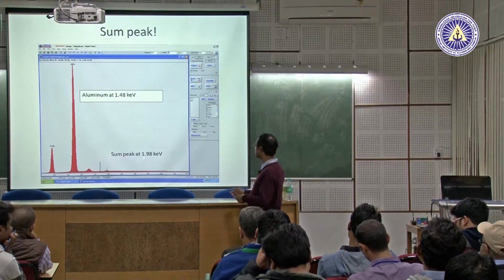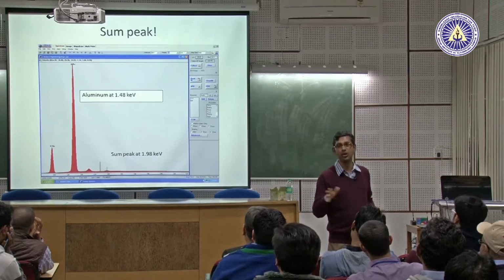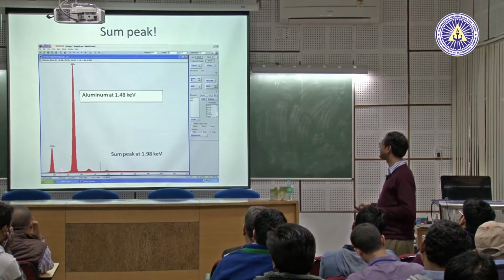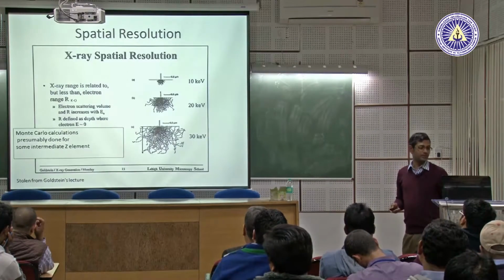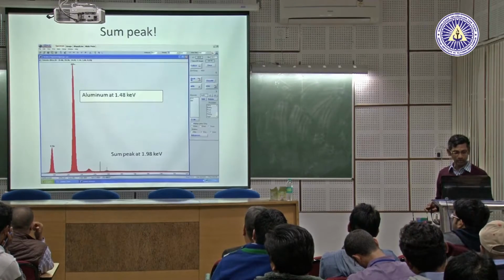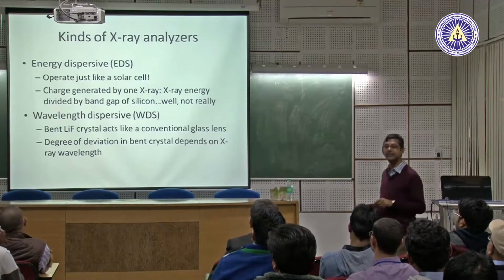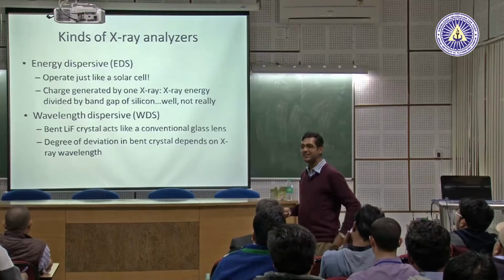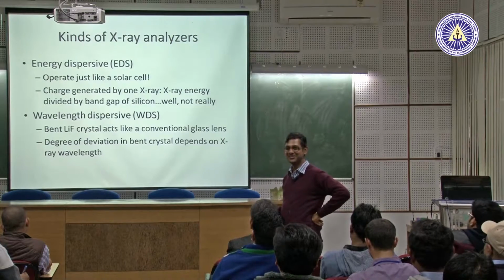So that's why the resolution of these EDS is poorer, and you cannot rely on the data too much because of many other issues. So this is one aspect. This I have already told, right? Okay. And on the other hand, this technique doesn't rely on this. This technique relies on X-ray diffraction. What is that?